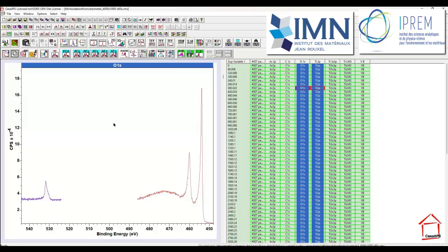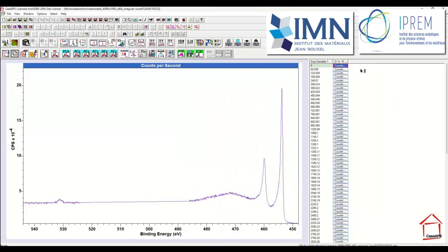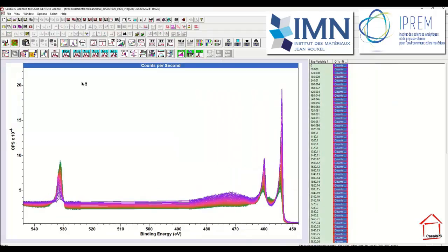So having prepared the scroll list in this way, we're then able to construct a new file using another toolbar button that says merge irregular. So each one of these display tiles with the oxygen and the titanium correlated in this way will form a new VAMAS block in a new file. So I've now got all of the data organized in VAMAS blocks containing oxygen and titanium for each of these experimental variables, so we can now process these data and see what shapes emerge from the spectra themselves, rather than guessing at what we think ought to be there.